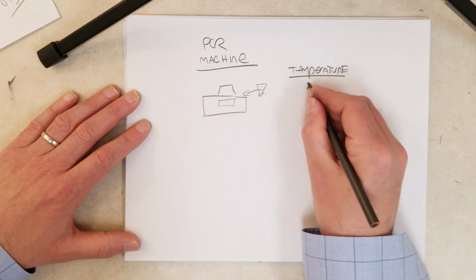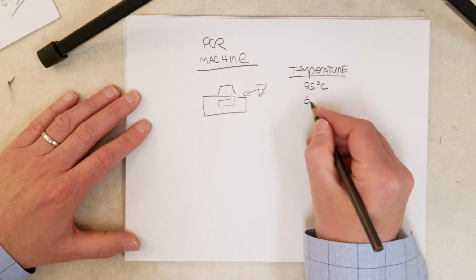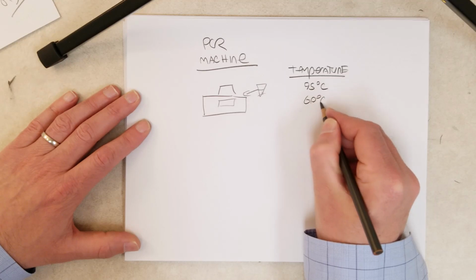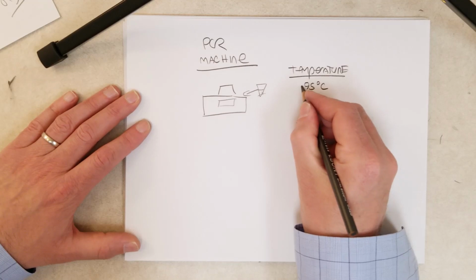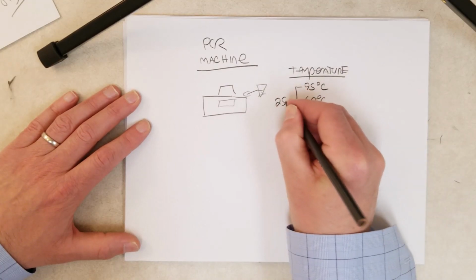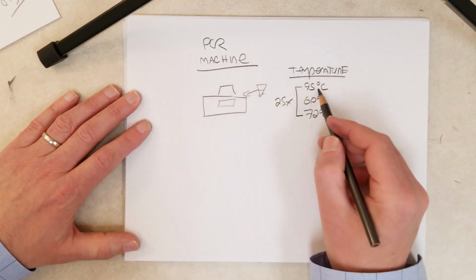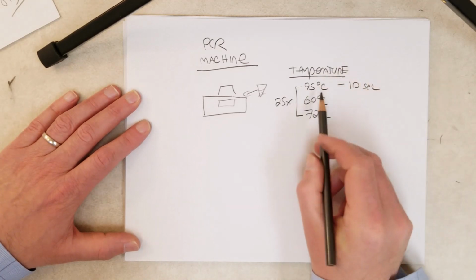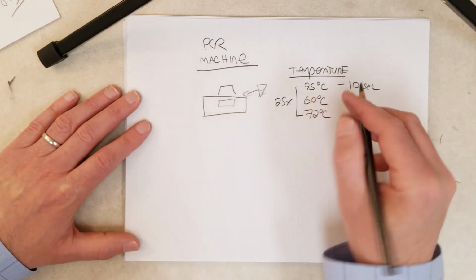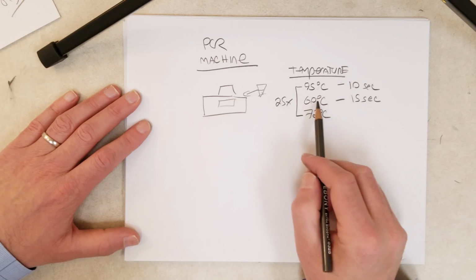It is really fast. So let's say our temperatures are 95 degrees for step one, denaturation, 60 degrees for annealing, 72 degrees for extension. Let's say we want to do this 25 times, and we just program this into the thermal cycler. We say we want 95 degrees, and a typical length of time for each step is going to be 10 seconds. It only takes about 10 seconds to denature all the DNA. And then the annealing, usually only 15 seconds. It's only 15 seconds for those primers to find the template and bind to the correct spot.